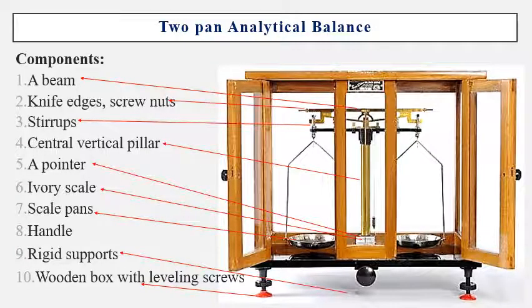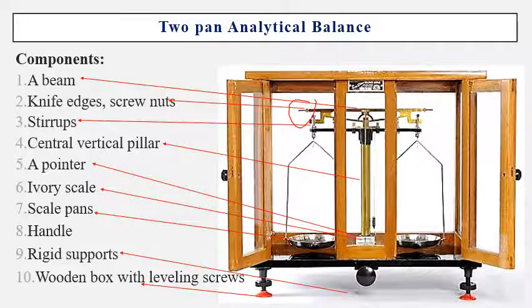This is the two-pan analytical balance. You can see the pan and a beam with two arms of equal length which will swing equally, knife edges with screw nuts, stirrups which support the weighing pans, a central vertical pillar, a pointer with an ivory scale, a handle, rigid supports, and a wooden box with leveling screws which will level the instrument equally.